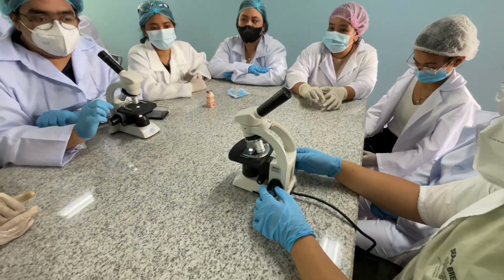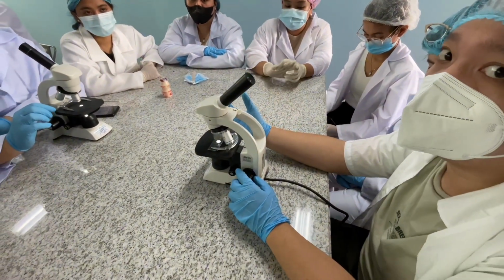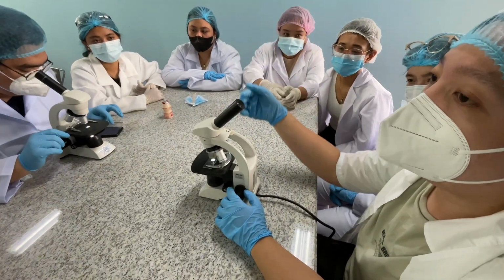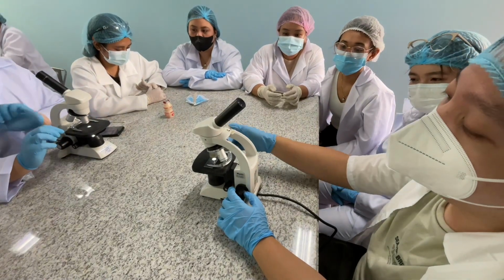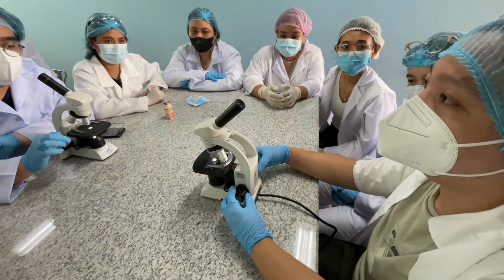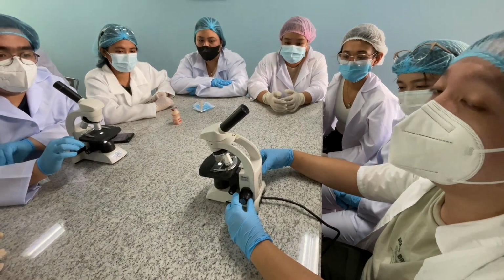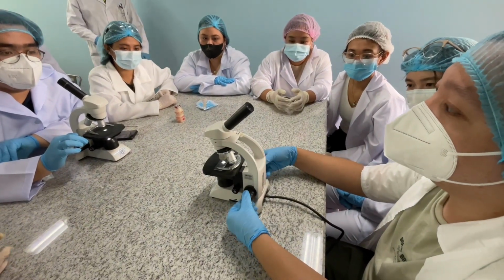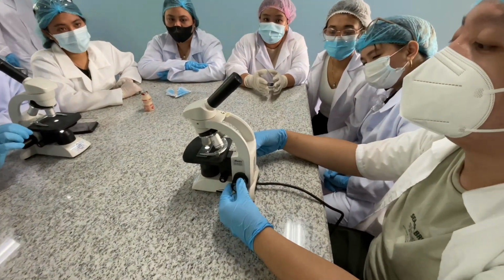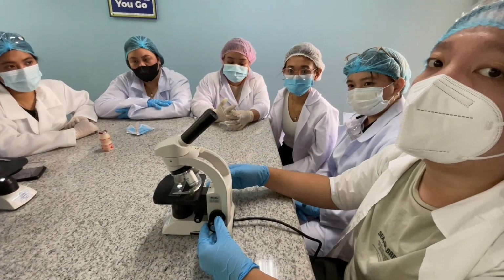And moving along, we have here our coarse focus. As you can see, unlike with the light microscope earlier, this electronic microscope doesn't have the tube itself na nag-goes up and down. This one moves the stage itself up and down. As Isaac said, always remember to use both of your hands in rotating them. As you can see, bumababa yung ating stage or going up. So, ano ba yung purpose ng coarse focus na to? It is for us to make sure kung gaano kalapit o kalayo ang specimen sa ating mga lenses and kung gaano natin siya dapat makita dun sa ating eyepiece.